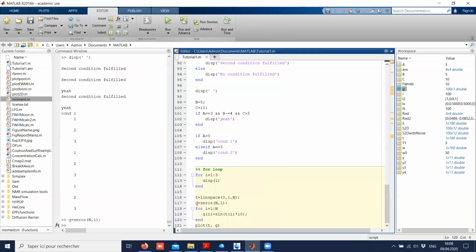Because here, if you don't do this, so if I comment this line, it's not active. I have this warning telling me that it's not very clever. Here n is only 100, so it's not playing a big role. If it's an array with 1,000 times 1,000 times 1,000 elements, or a billion elements, allocating the space at every iteration will take a hell of a time. In my codes, whenever I know the size of a vector, I will always save it like this, and then rewrite the elements one by one.